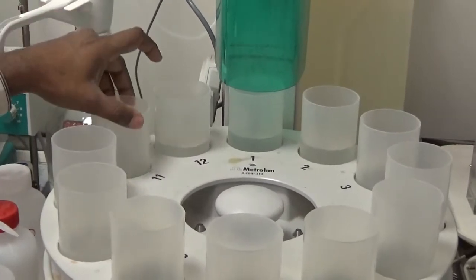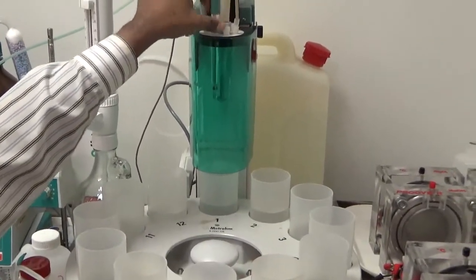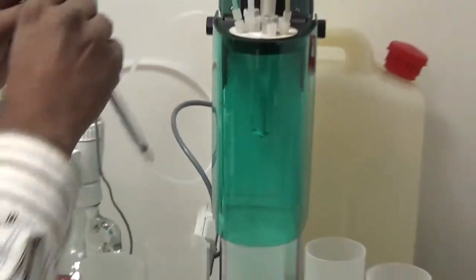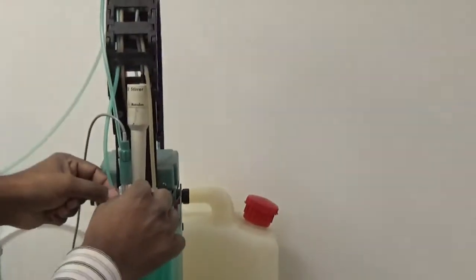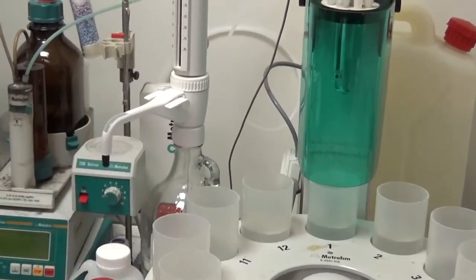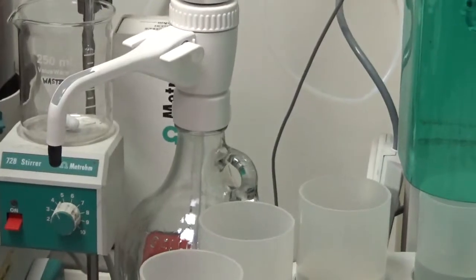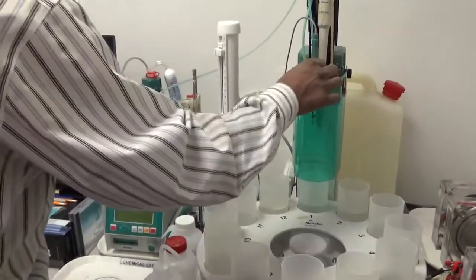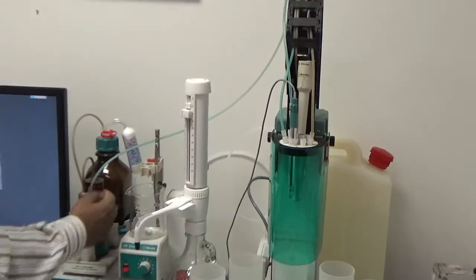We put 10 samples from station 1 through 10, and stations 11 and 12 we keep for rinsing and cleaning. The column goes down with the electrode inside. We use a silver electrode for chloride analysis in the potentiometric titration. There is also a buret which goes inside, along with a 722 rod stirrer as opposed to the 728 magnetic stirrer.